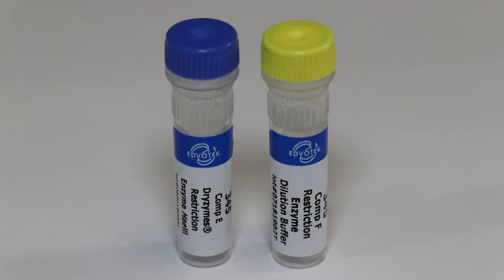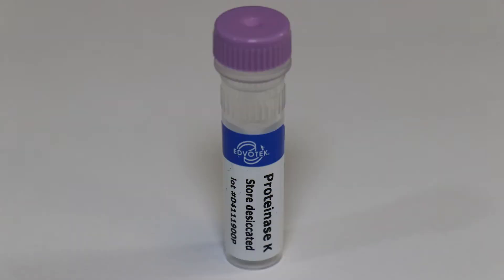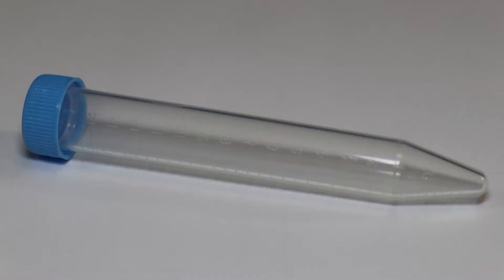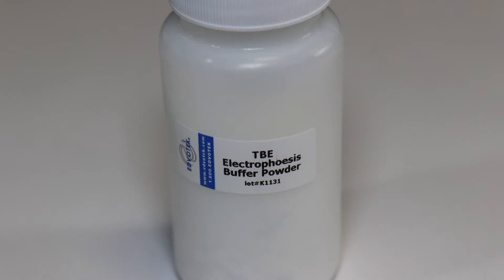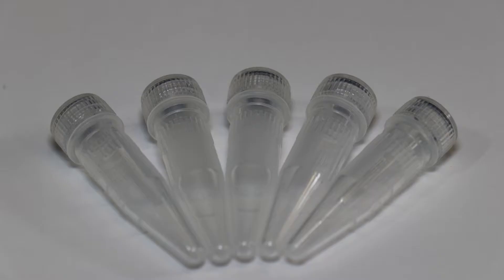Components E and F: dryzyme H3 and enzyme dilution buffer, Component G: 100 base pair DNA ladder, proteinase K, salt packets, disposable plastic cups, 15 milliliter conical tubes, TBE electrophoresis buffer powder, ultra spec agarose powder, 1.5 milliliter screw cap tubes.